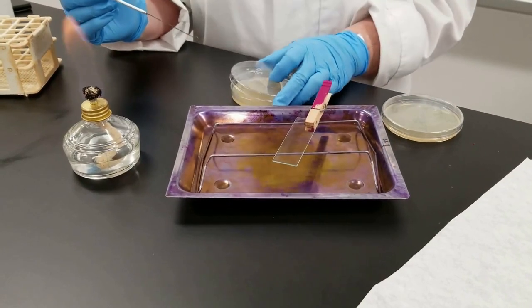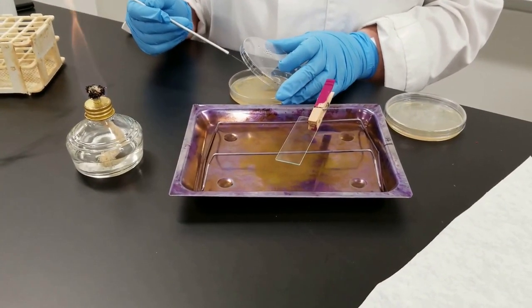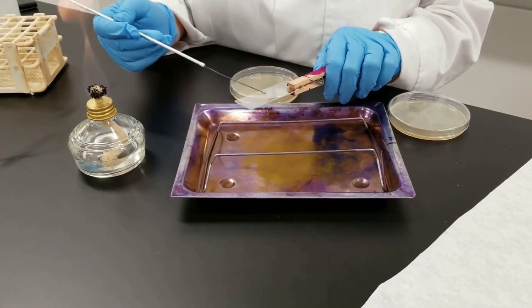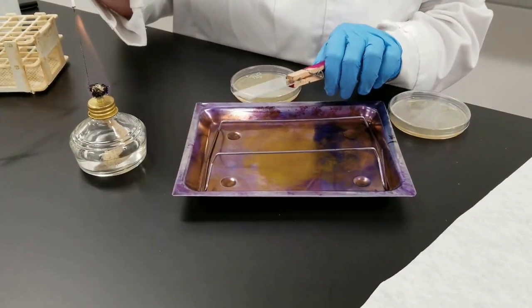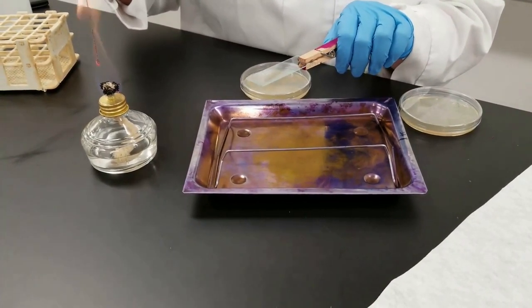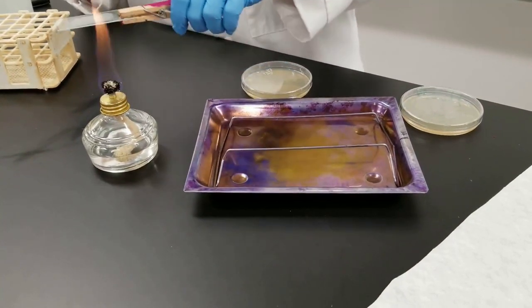I have two different cultures. The first one that I'm going to do right now is Staphylococcus aureus. So I'm going to take a culture or a swab on, make a smear here. Flame my loop. We need to heat fix once you have done a smear. That is going to adhere the bacteria to the slide, kill it, and also make the stain easier to penetrate through it. So that's what we're doing right now, heat fixing it.